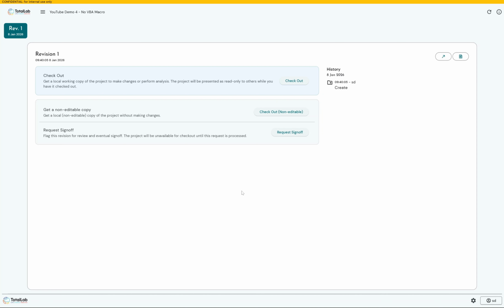We can only do certain things and pass certain things into the program. So we can't pass the command to do, like, file new, but we can pass the command through to say open a read-only copy of a document. So we do have limitations, and it's just how do we work around those with yourselves if you're interested, or what is it that you're willing to accept on site for your QC teams.